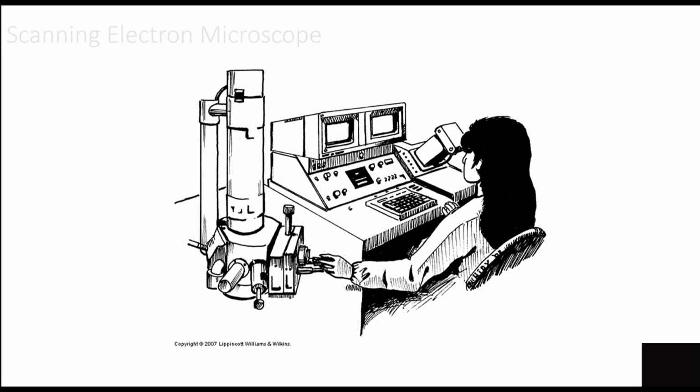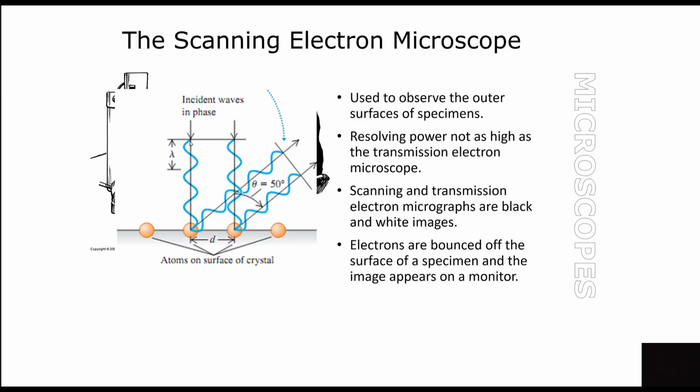And so it's very simple. Your specimens go in the center here. It's usually vacuum, almost a perfect vacuum in a scanning. It's not perfect totally, but it's good enough. And then the visualization part of what bombards the screen. And so we can put a specimen there, usually live or not, and it won't live very long. And then bombard it with the electrons, and you'll see the scanning as it takes the electrons. And of course, wherever those molecules of metal are, it's going to hit, and then wherever the area is that it's going to reflect, you can see that with the image on the screen.